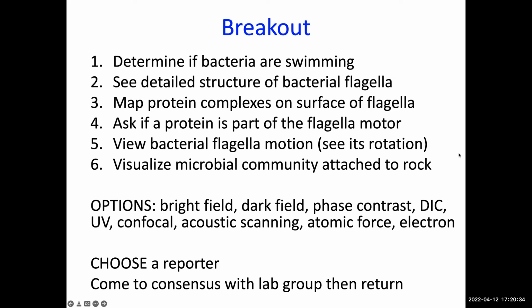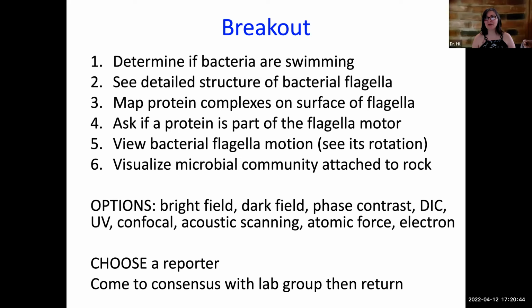You can see the very details. Yeah, the resolution of it is excellent. Yes, I agree. It might be the only one that would allow us to see that level of detail. Good. All right. Number 3 was map protein complexes on the surface of flagella. Did anyone come up with an option for that? Raise your hand.